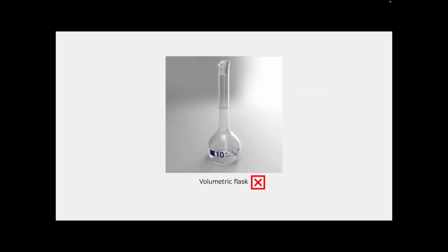Volumetric flask is another glassware that is not suitable to measure volume. It is usually used in preparing standard solutions.